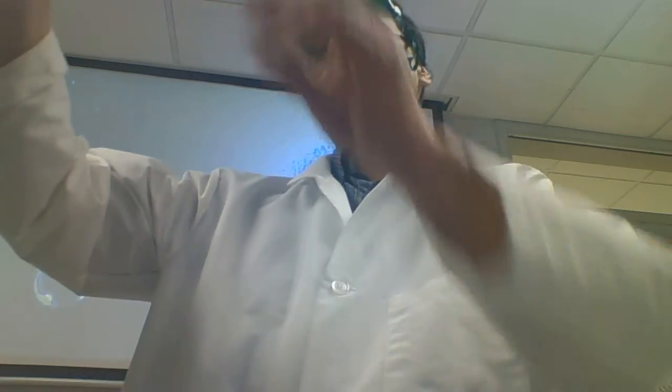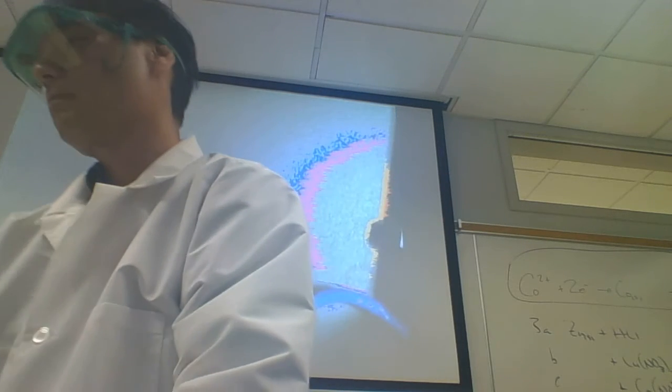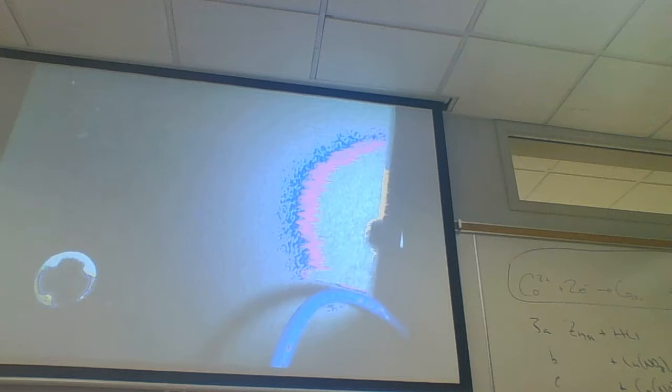And so we're going to take some cobalt metal and react it with what? Hydrochloric acid. So let me get my hydrochloric acid here. There's a 6 molar. And so I'm just going to drop in some hydrochloric. I'm not going to be very careful. Can you see it better here or through here? Probably better if you send it. I mean, I can see it, yeah. Okay, let's go for it then.